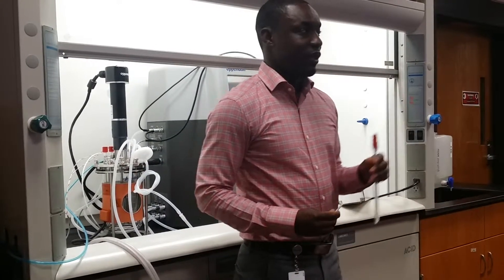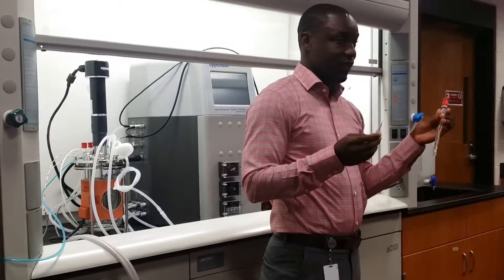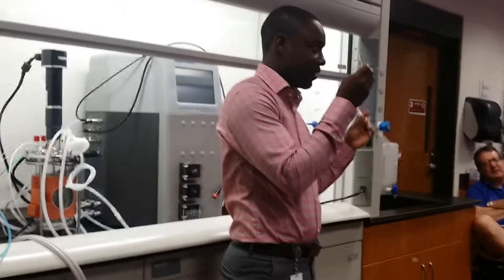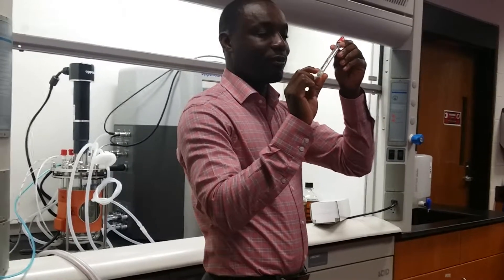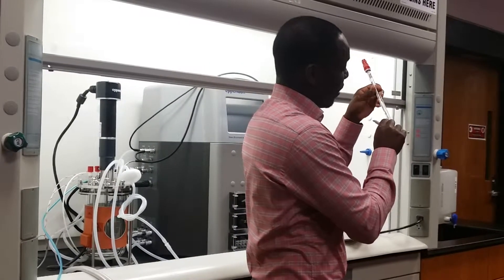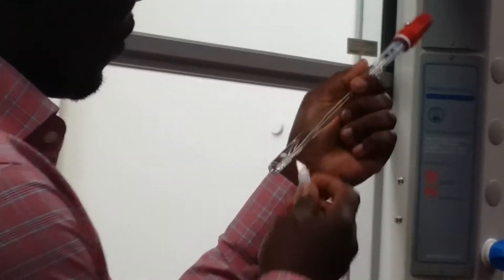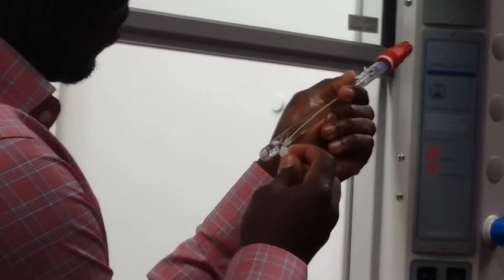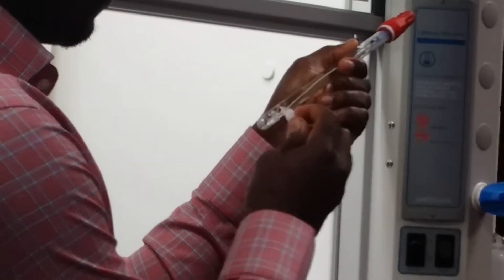Back to the pH probe. The reason they send you that little razor — it's a little razor inside the box packaged with it — is because there is a little adhesive that's closed or blocking the entrance of the probe. In order to get an accurate reading, you have to scratch off that little blockage on the surface. So we usually go in and just slowly and evenly scrape off the excess material.